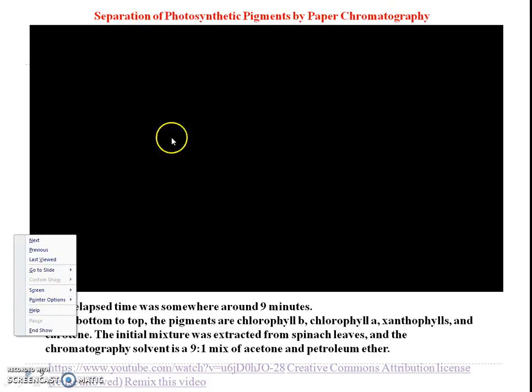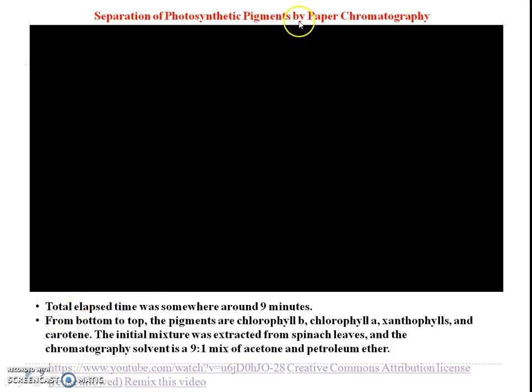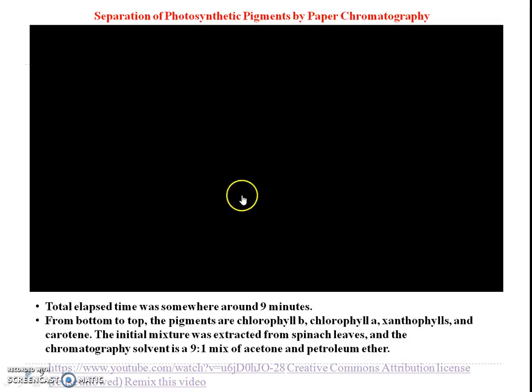Have a look at the video for the separation of photosynthetic pigments by paper chromatography.